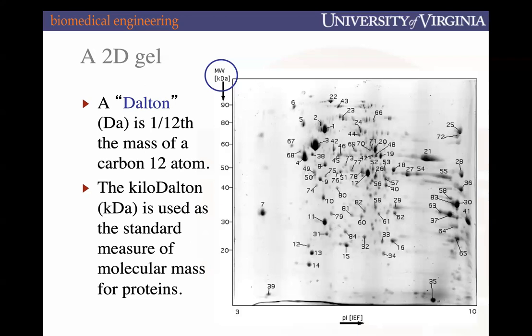So in this case, this 2D gel likely had some sort of total protein stain, not Coomassie blue here, that enables them to see everything, but yet not knowing what their identity is quite yet. And so it's tagged by hand after some sort of stain, particularly depending on where their molecular weight is, if you have something of interest.